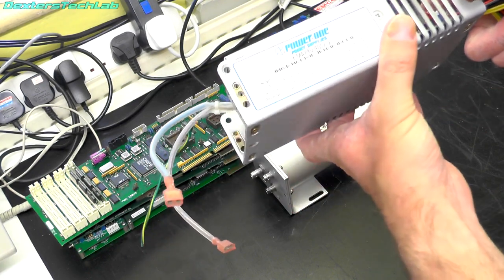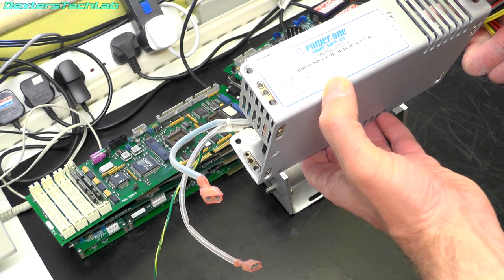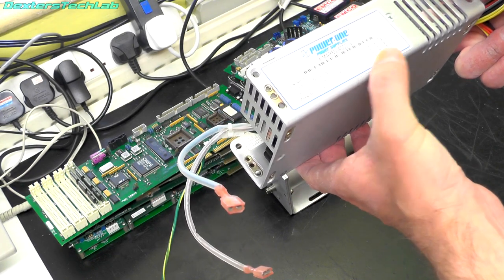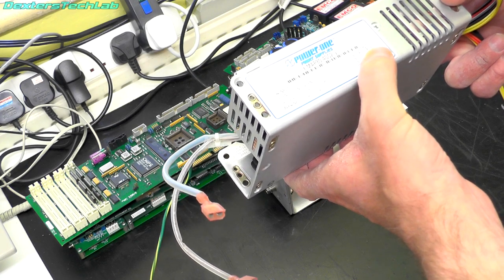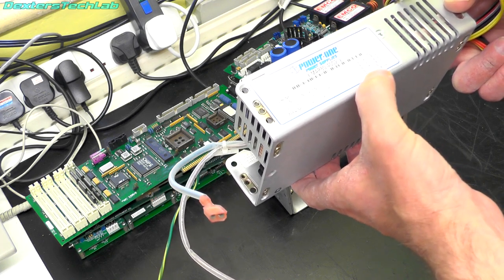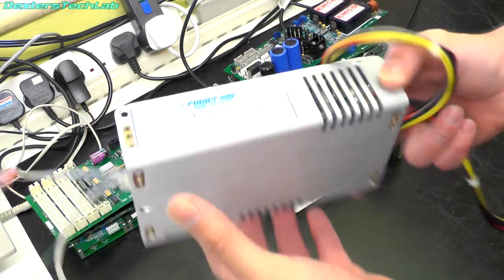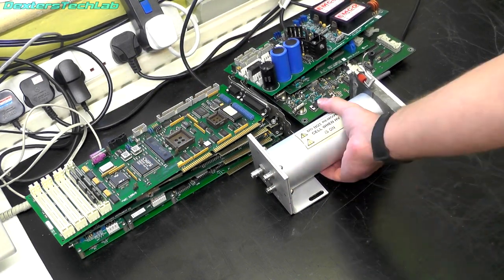Next up is the power supply — this is a Power One branded unit, a fairly decent make. It's a switching power supply with universal input I would imagine. The outputs: pin 1 is plus 12 volts at 1 amp, pin 2 is minus 12 volts at 1 amp, pin 3 is plus 12 volts at 2 amps, pins 4 and 5 plus 6 and 7 are plus 5 volts at 14 amps. So a pretty standard chassis power supply — that's probably useful to keep.